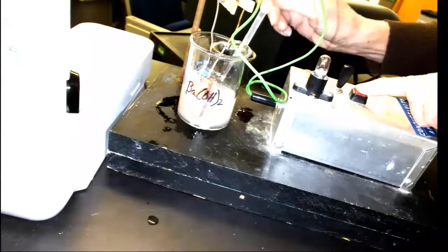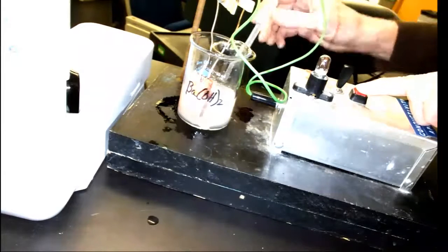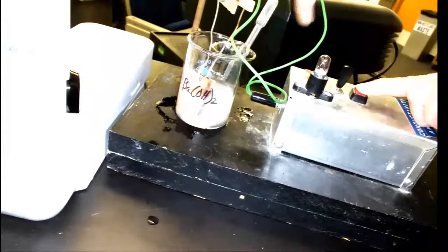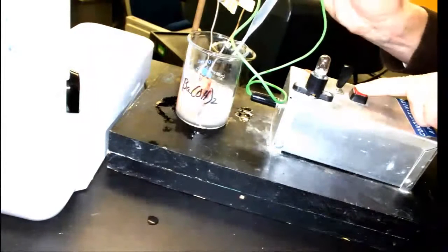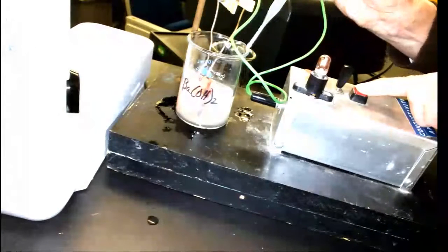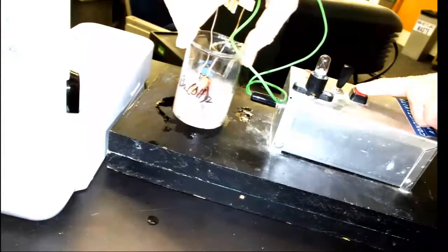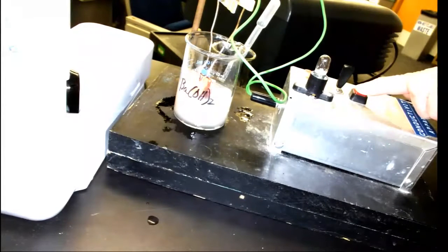Contrary to how I tried it in class the other day, it didn't work as well. I'll add a little bit more. And I don't know if you can see it, but there's a very, very faint glow of the light bulb. Essentially, almost no ions are left in the solution. Oh, I squeezed it onto the electrodes again, and look at that. Absolutely no glow. No glow left at all. Apparently, all of the ions have reacted to make barium sulfate, and the second product is water. And there's nothing left to conduct electricity.